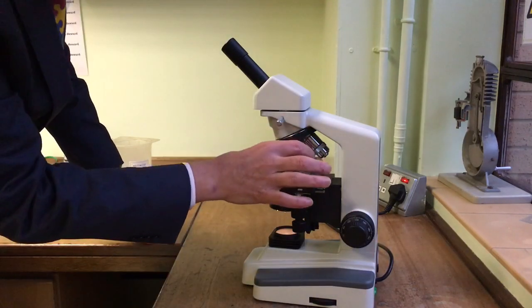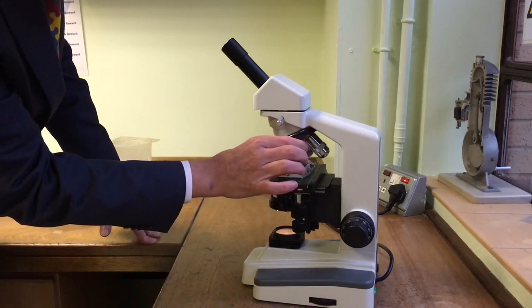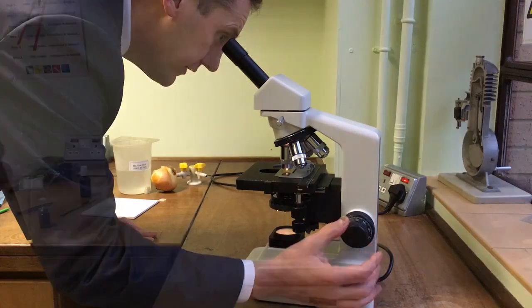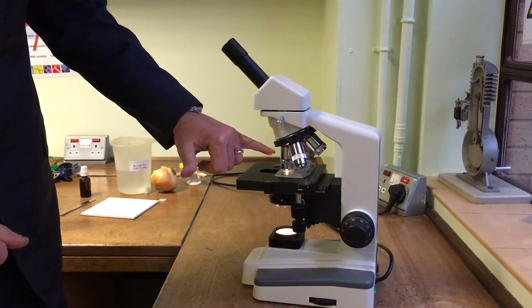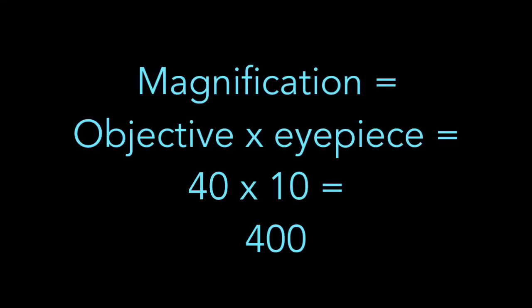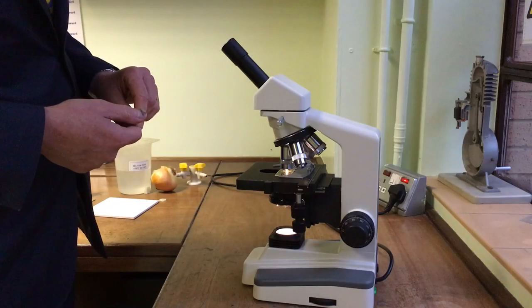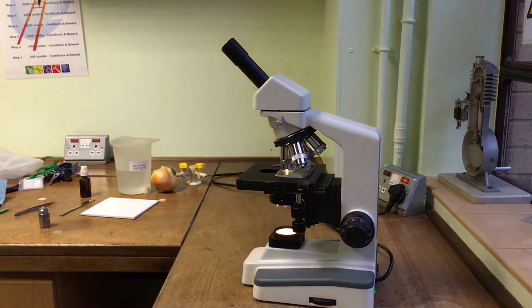Now that I've got it sharp, I can switch to a higher power objective lens to achieve higher magnification. That's still in focus. I've got the microscope now focused with the 40x objective lens combined with the 10x eyepiece lens—10 times 40, that's a total magnification of 400x. The cell is now quite large in the field of view. Let's have a look at what that looks like.